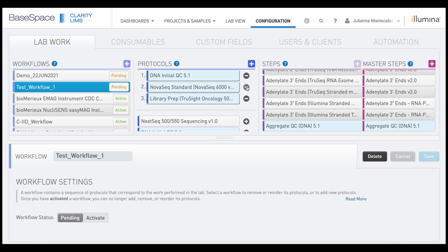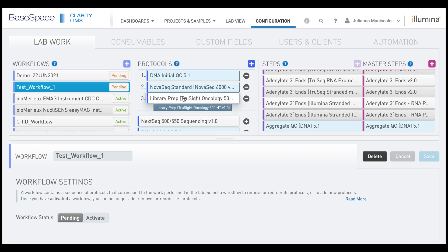While your workflow is still in a pending state, you can reorder the protocols in this workflow by clicking the protocol name and dragging and dropping it.